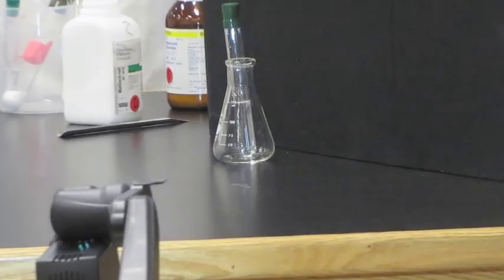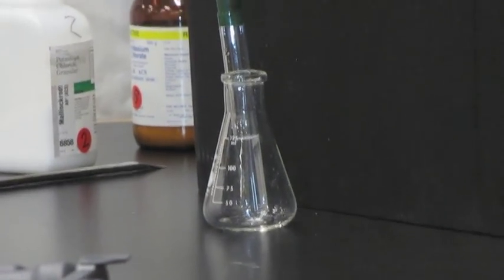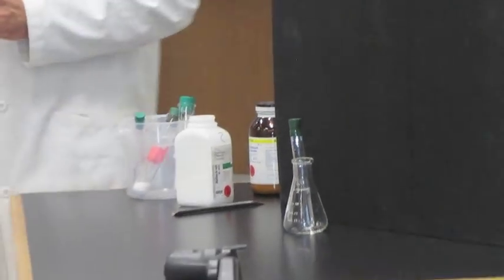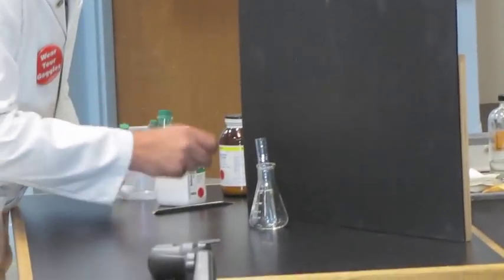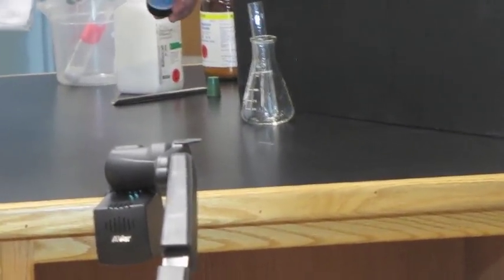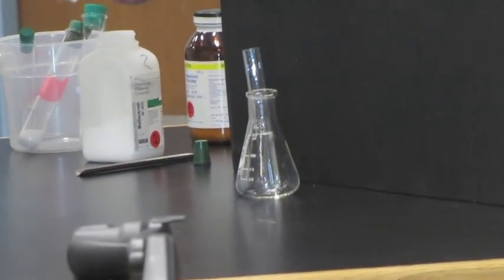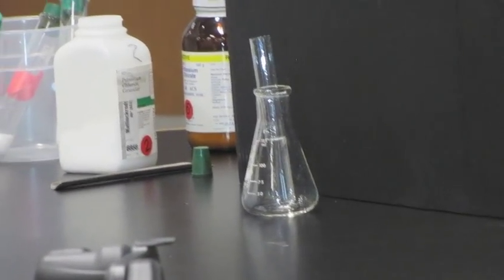So, I'm going to add to it some silver nitrate. What's the formula for nitrate? You have NO3 with a negative charge? Yeah. I'm going to add a little bit of silver nitrate to it. There we go.